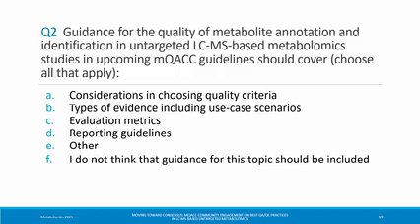Hello, this is Marin Kolashevska. I'm a Thermo Fisher Scientific representative responsible for mzCloud, so I can share how we do the in-house library, let's call it that. We usually take the analytical standards, cover both ionization modes, and go into MSn as far as it allows us to go.